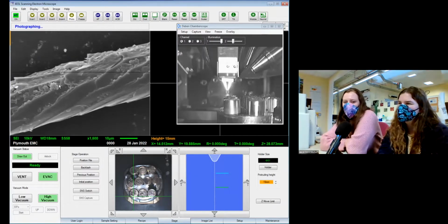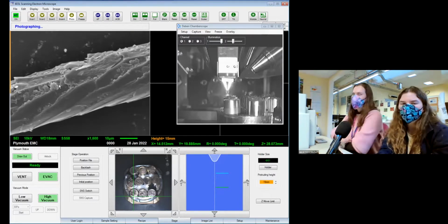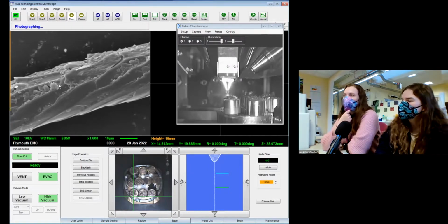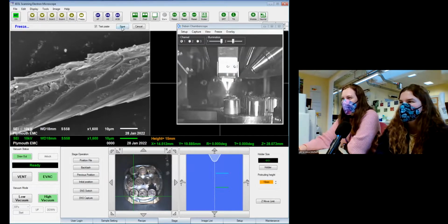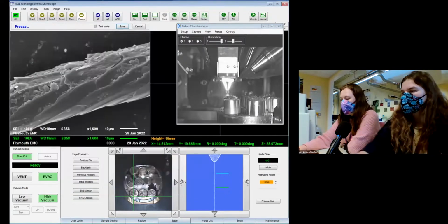A lot of SEM work is like going to the opticians, trying to work out if this is better focus or worse focus, and you're going back between two very similar things. Because we all have different eyesight as well, often you end up having to ask for a second opinion. And then we all have different opinions on contrast and brightness. So everybody's like, yes, you've got to be like this or this. It's like, no. And then microscopes have different opinions on contrast and brightness as well. Oh yeah, they do. And focus sometimes, when the autofocus does want to work. It's pretty okay on this one. I don't trust it on any other machine. This one's the only one I've found where the auto contrast, brightness, the focus and the stig all kind of work. Everything else just blows it all out.